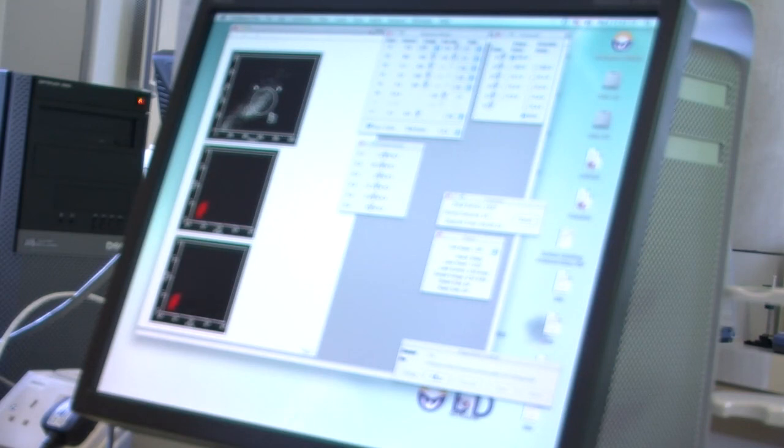And again, that's quite important to run in duplicate because it only takes someone to accidentally put their pipette into the wrong antibody tube and put a little bit of antibody into the isotype match control and it's wrong. So running it in duplicate means when I look at this data later, I can see that we've got 2 isotype match controls that are the same for each of our cell lines.